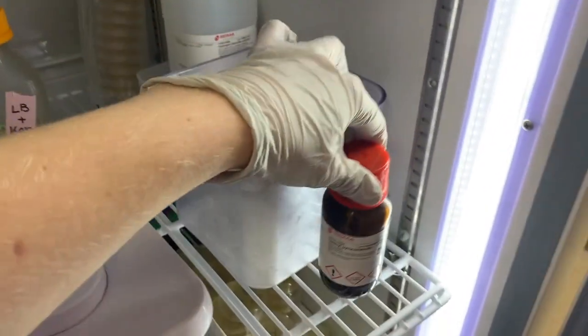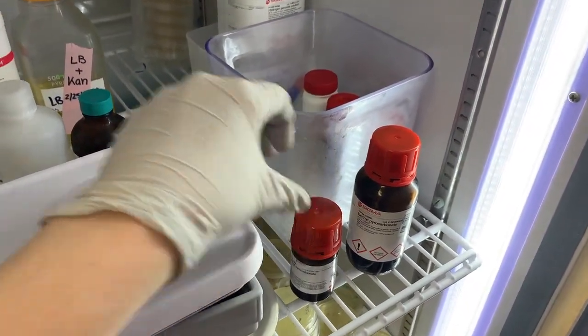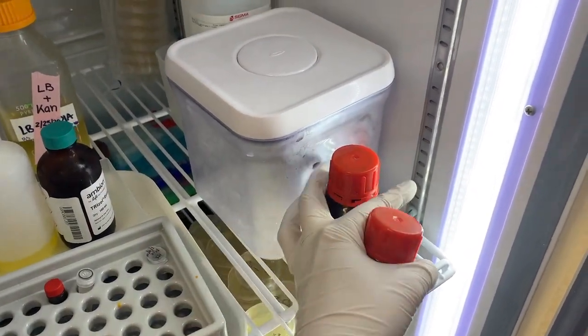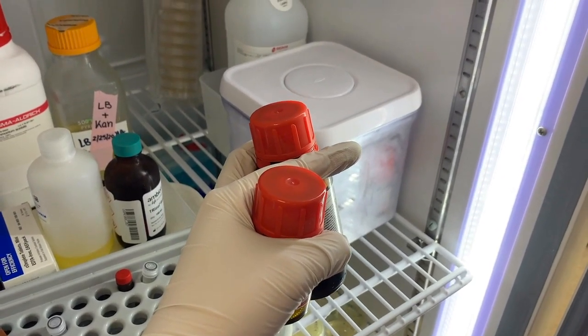There is. I'm going to take both of them. If we have more than one of something, try to use up the old chemical before going to the new one. So I'm going to take these 2 chemicals into the chemical bench for my Dep C treatment.